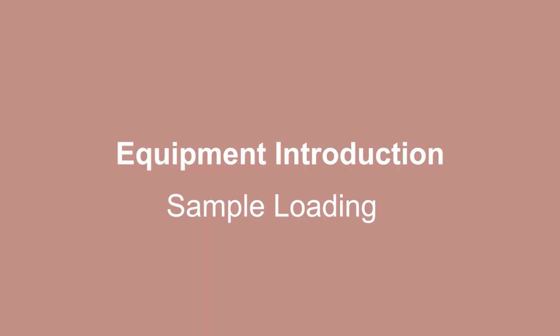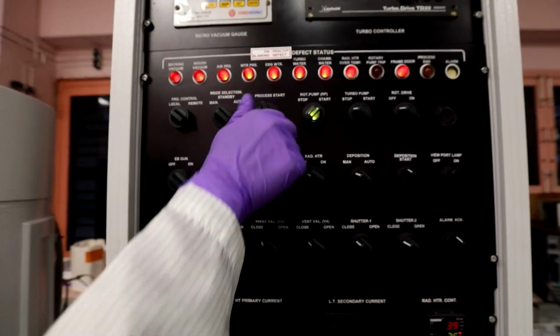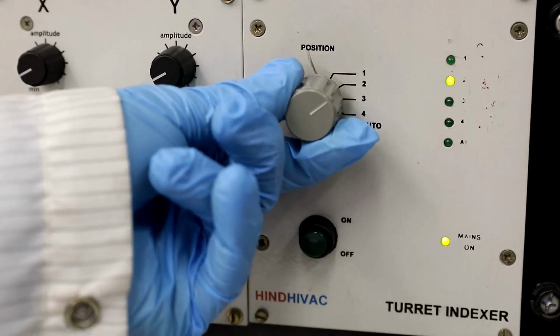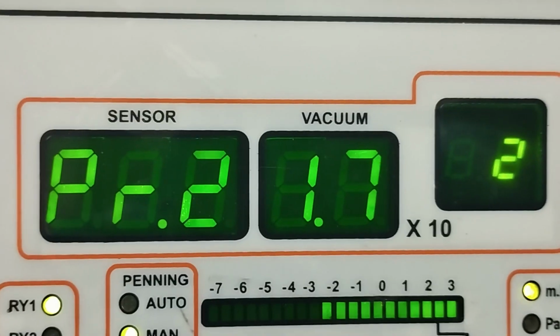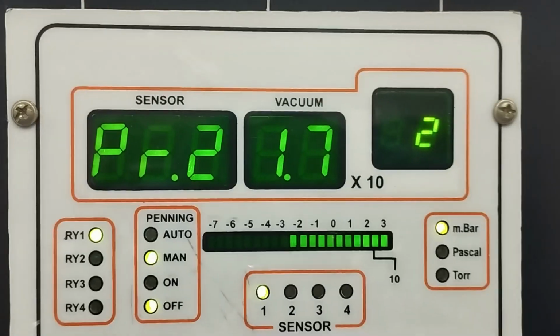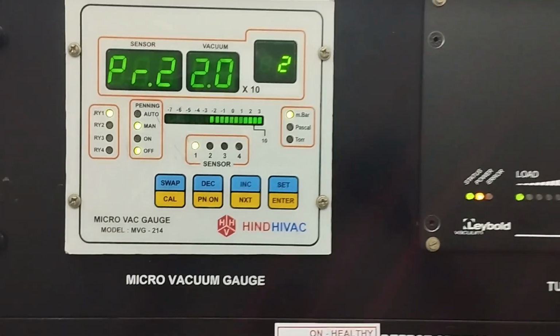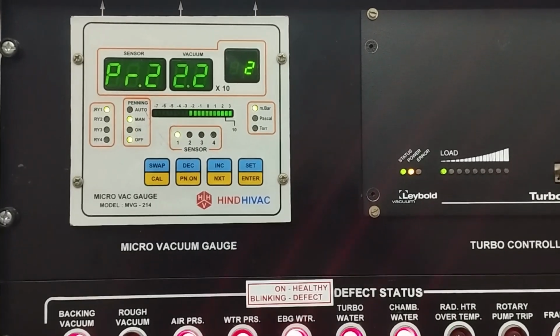Equipment introduction and sample loading. Switch on the system and vent the chamber for sample loading. When the chamber pressure reads 1000 millibar, atmospheric pressure, we can open the chamber to load the sample inside the chamber.